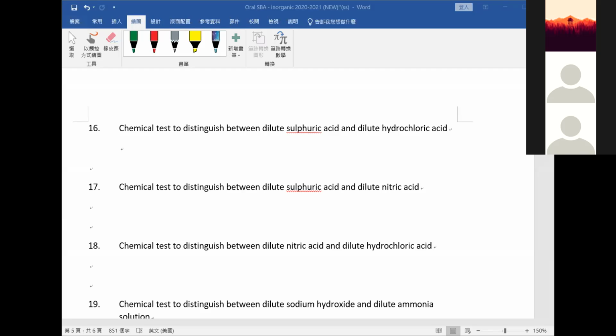Any observation? You just tell me NO and something else, right? So what is the gas? And you may add something like colorless. Now this one you should tell in full. You mention the formation of colorless gas bubbles of NO, which rapidly turns brown near the mouth.